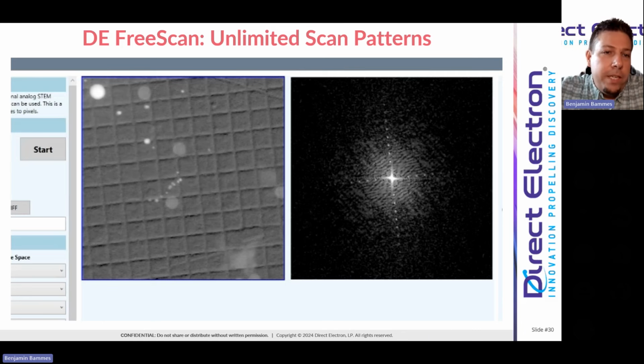And I'm showing an FFT of this image live as it is being acquired. You can see the vertical and horizontal line across the FFT from the missing information in here, and then when it completes, those disappear, and you see the spacing of the calibration grid, which is my favorite specimen.